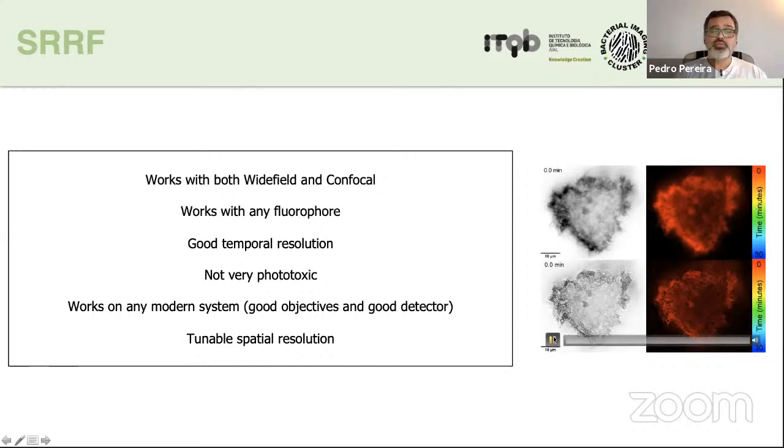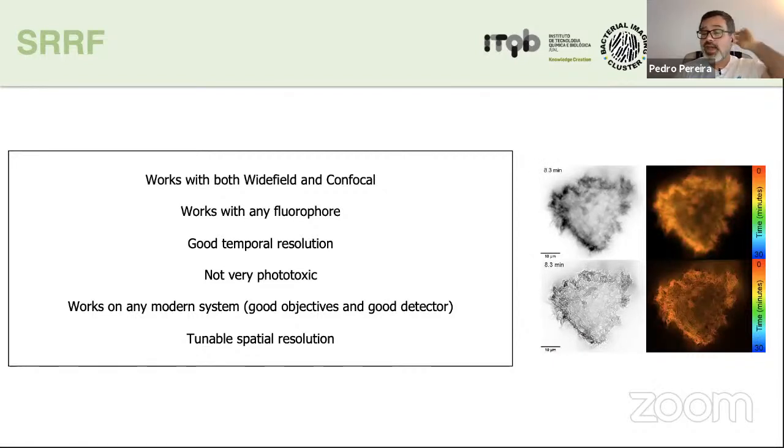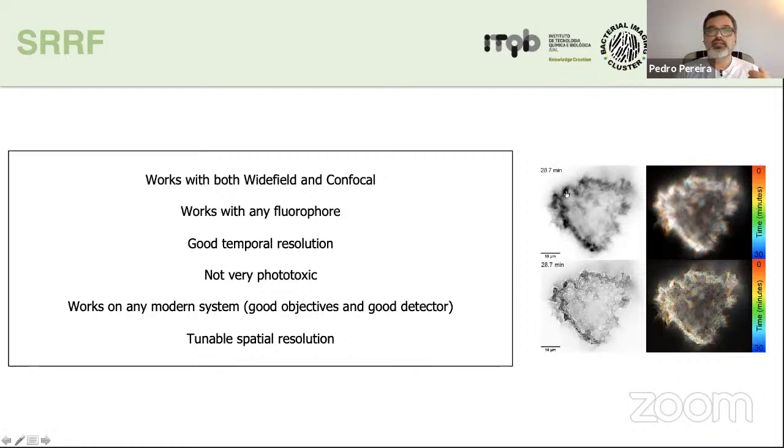Just to give you a notion, this movie that you have here on the right is continuous imaging of GFP tagged actin, actually utrophin, but what you're seeing is actin. Imaged constantly, nonstop for half an hour in a LED wide field. And this is the wide field and this is the super resolution result. So in reality, when I say you can use this in any microscope, you can literally use it in any microscope. And again, if you want to use it, you just download it from Fiji and use it. It's free to use, open source and so forth.